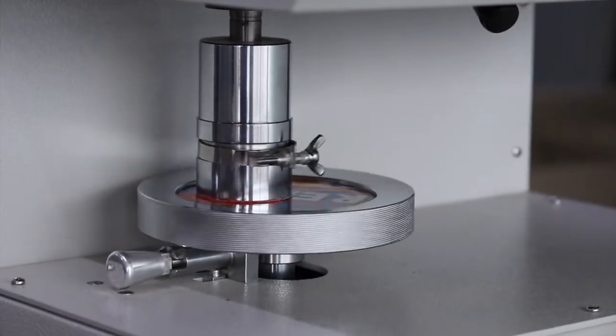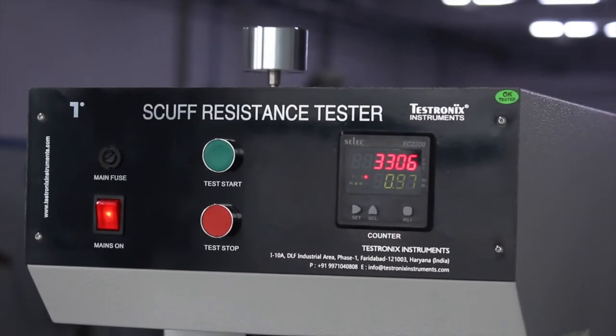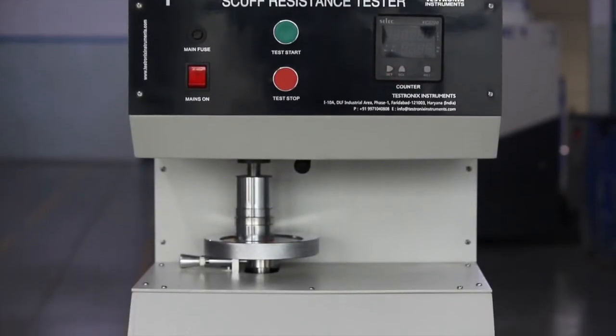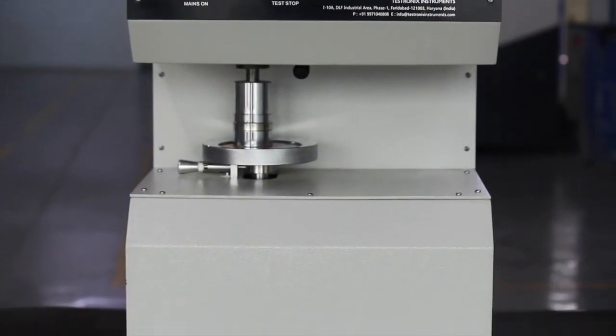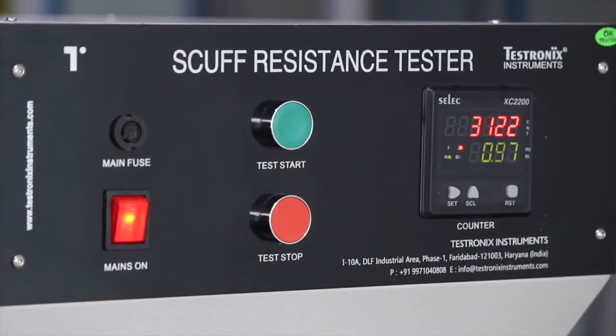The Testronix scuff tester rubs two printed materials against each other face to face in the same plane at constant speed and rubbing pressure. This instrument can also be used to prevent color transfer from one printed material to another or any coated surfaces.